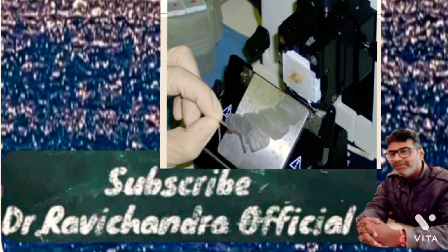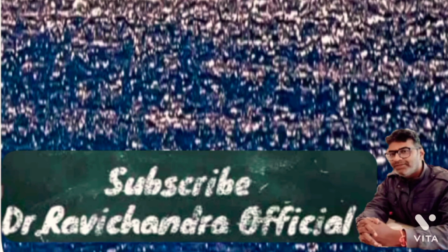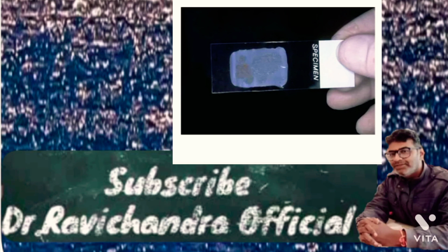Floating. After sectioning, the sectioned tissue is placed in a warm water bath to float, which helps to remove the wrinkles. Mounting slide and numbering. Sectioned tissues are picked up on glass microscope slides from the water bath and are placed in a hot air oven for 15 minutes to help the sections adhere to the slide. The slide is then numbered by using non-removable ink.